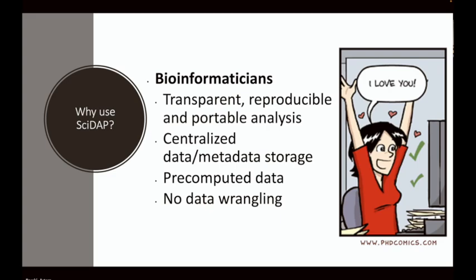The data are stored centrally together with metadata, and this allows easy reuse of the data, sharing of the data, and continuing to use the data.